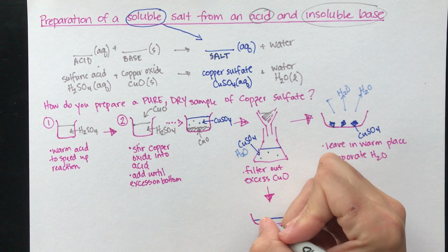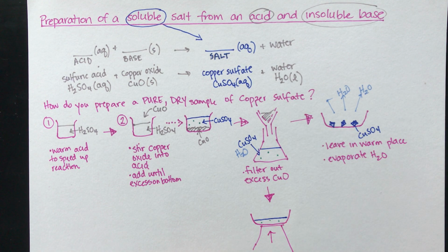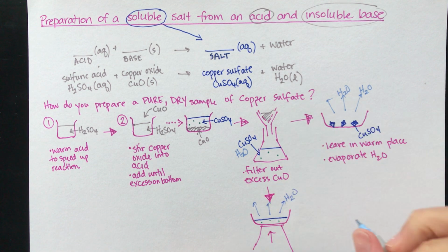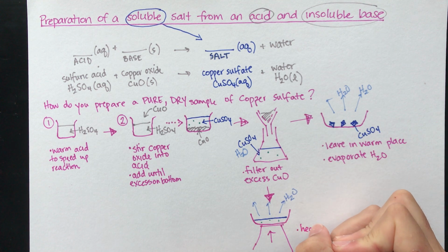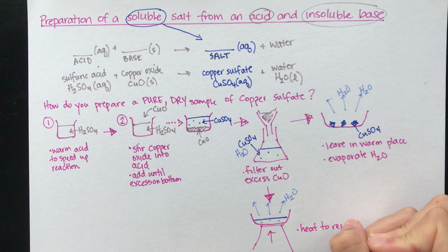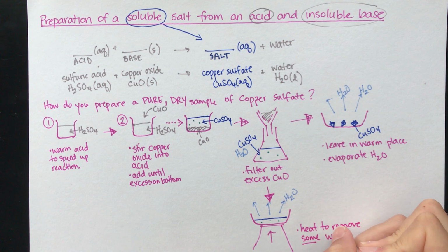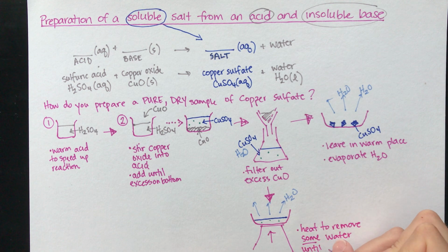You've still got your impurities, but a lot of that water has gone. So we heat to remove some, not all, some water until the solution is saturated.